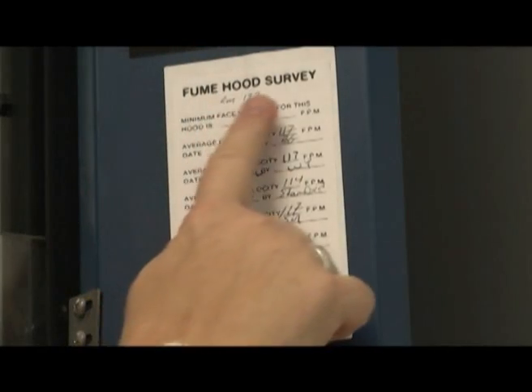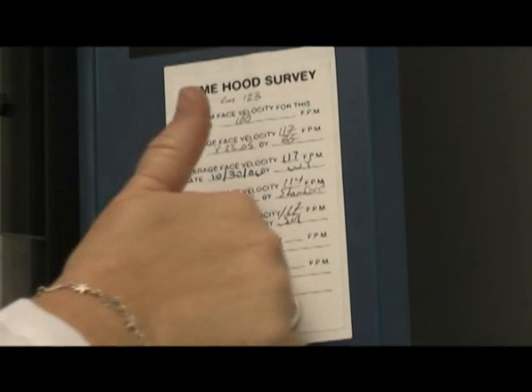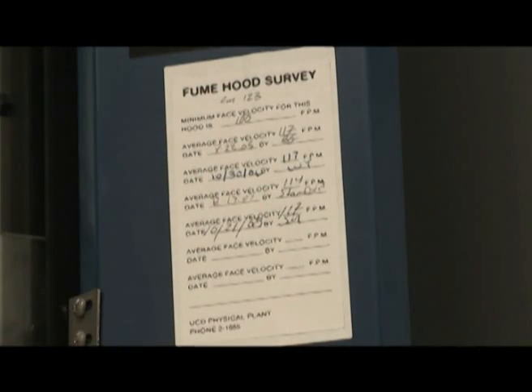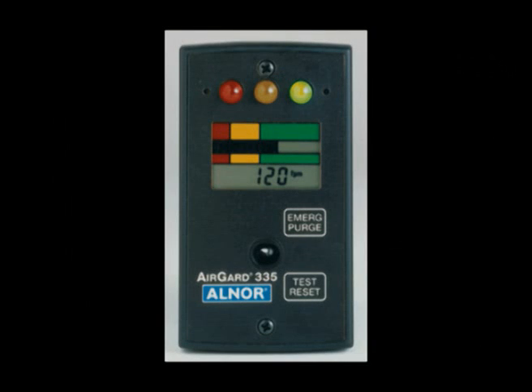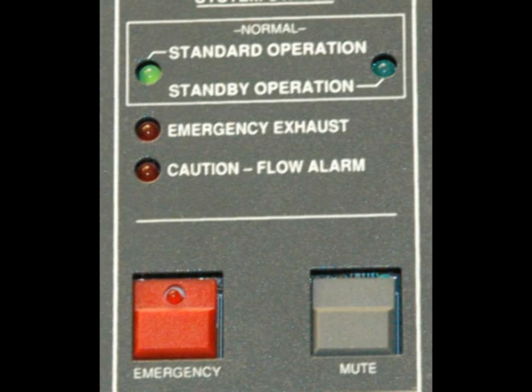Check the hood certification sticker. It will list the date facilities management last checked the hood, the average inflow, and whether the airflow was satisfactory. One should always check the quantitative airflow monitor or alarm to verify that airflow for the fume hood is proper. There are several types of airflow monitors used on campus fume hoods. For this video, we will show you a few of those common types.